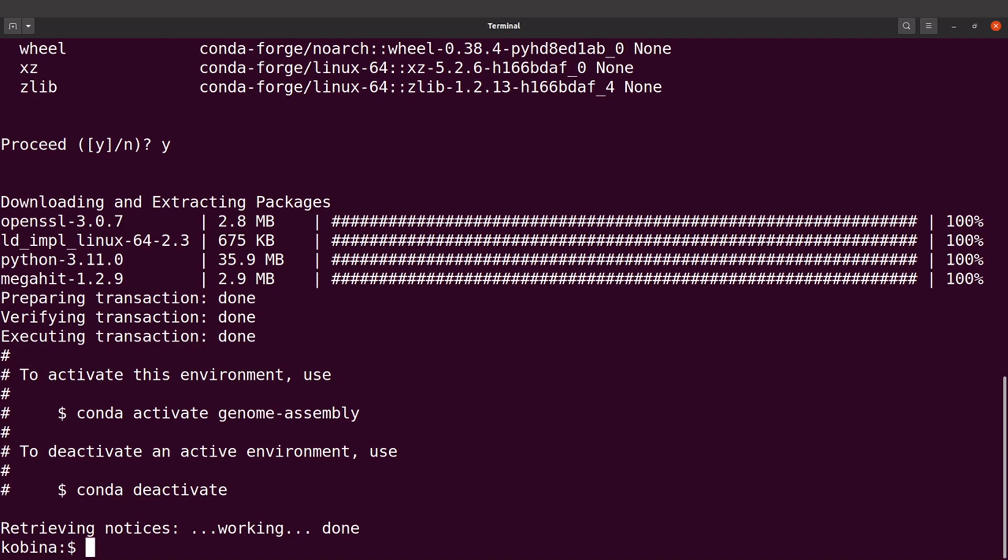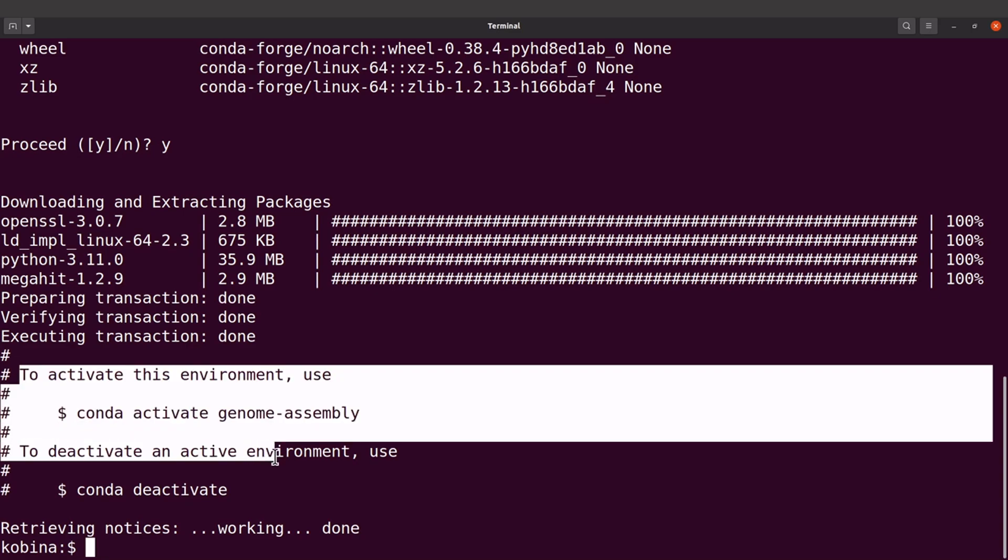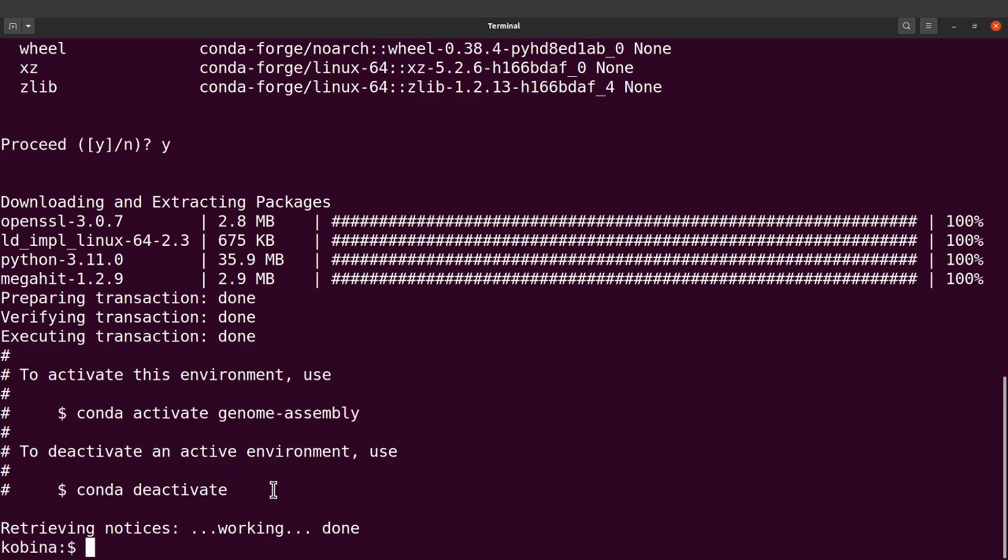MEGAHIT has been installed. You will see this statement here telling you how to use MEGAHIT. If you want to use MEGAHIT you need to activate the environment using this command. If you want to deactivate the environment you use this command.